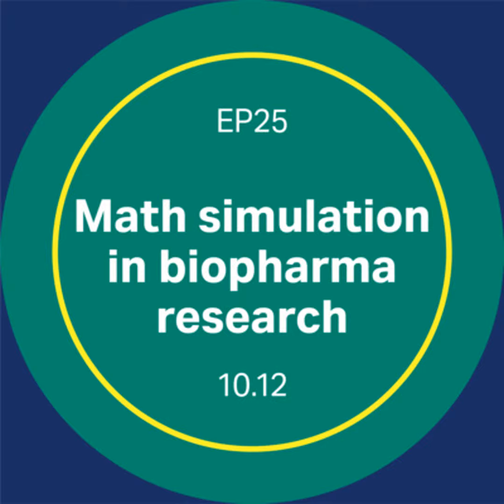The good thing about modeling is that it allows you to understand an event, like a chromatography separation. And it allows you to simulate it. So you can do many experiments in the computer. The thing with mechanistic modeling, as opposed to statistical empirical modeling, is that the equations you use are actually based on fundamental physico-chemical processes that take place during chromatography.